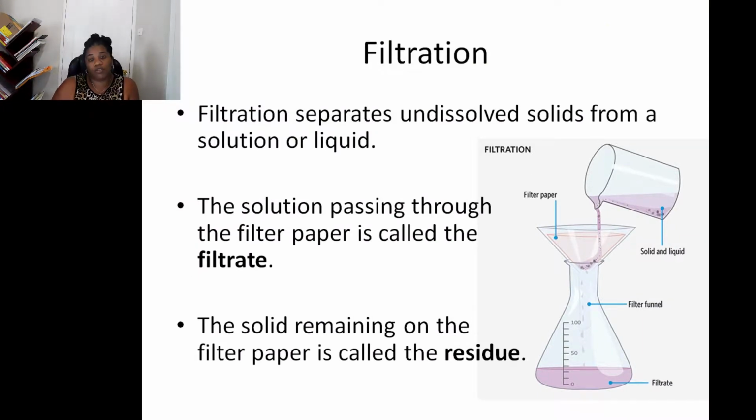So let's start with filtration. Filtration separates undissolved solids from a solution or liquid. The solution passing through the filter paper is called the filtrate, and the solid remaining on the filter paper is called the residue, as you can see here.